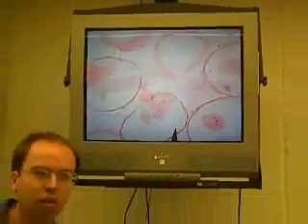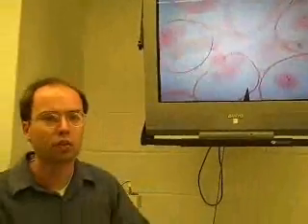So I want you to make sure that you can recognize all the different parts of the Ascaris meiosis, and know what's going on in each of the slides, if you see a photograph of them on the final exam.